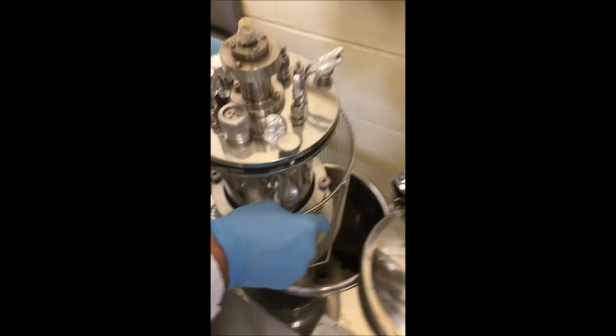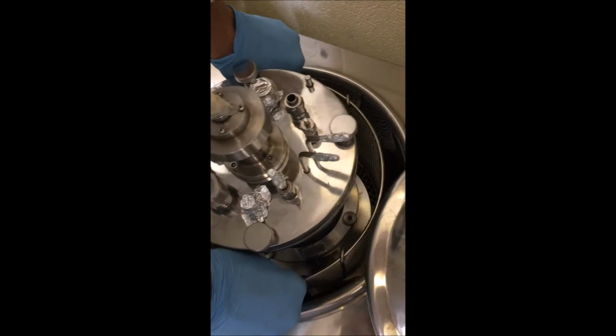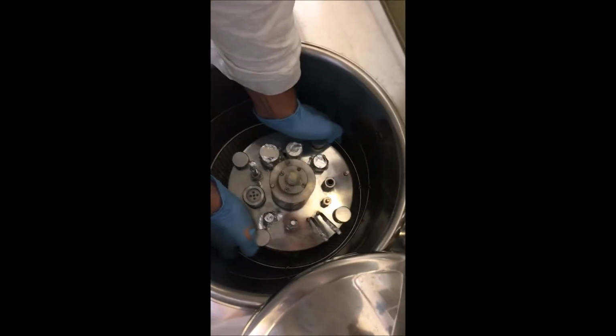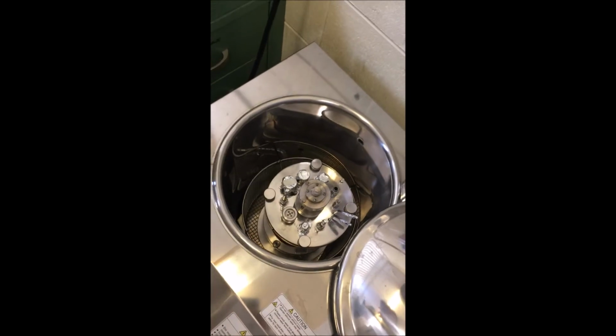On the day before running the experiment, the bioreactor was assembled and flasks of media were prepared for inoculation of E. coli. On the day of the experiment, the bioreactor was running at 37 degrees Celsius and 300 RPM, while the benchtop shakers were running at 37 degrees Celsius and 200 RPM.